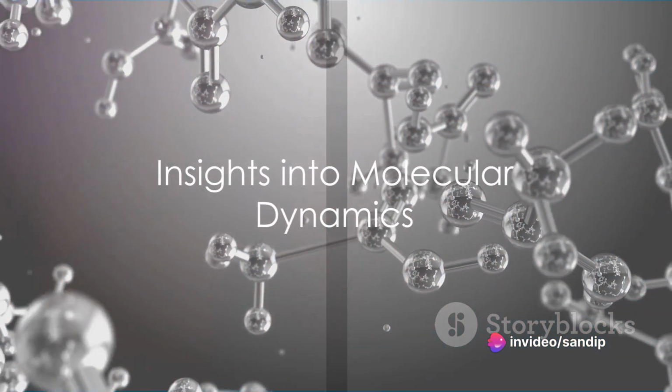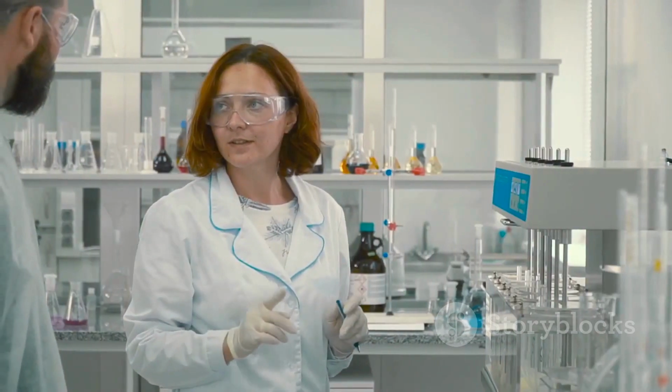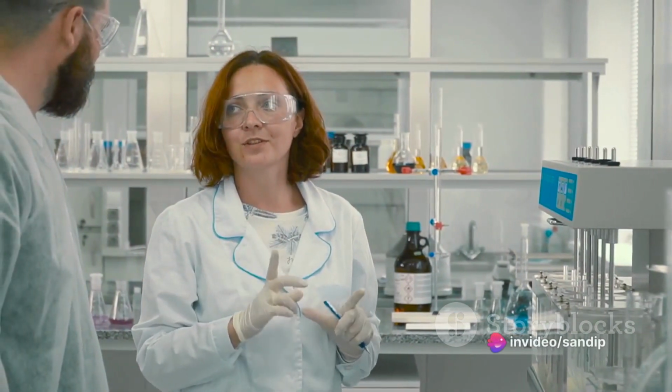Finally, NMR spectroscopy can reveal information about the dynamics of molecules. Through a process known as spin-spin coupling, nuclei can interact with each other, causing splitting in their NMR signals. This splitting provides insights into the relative positions of atoms within a molecule, shedding light on its three-dimensional structure.